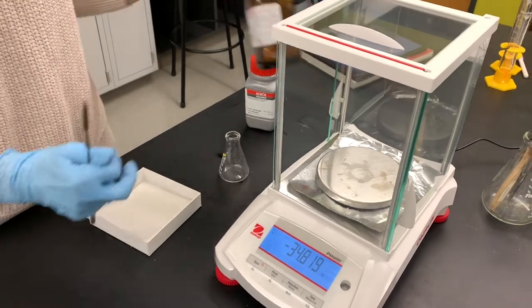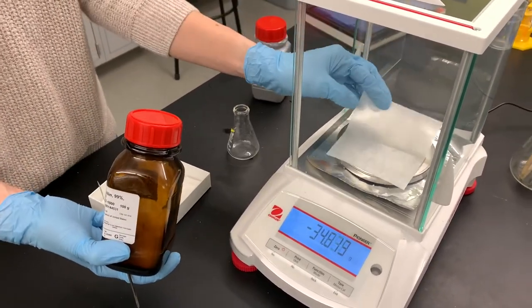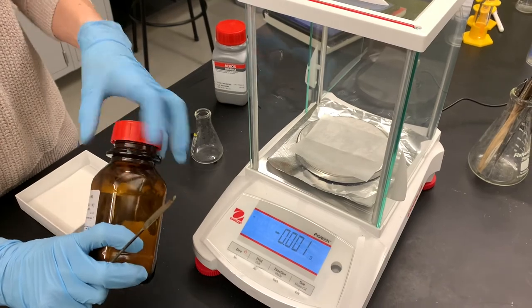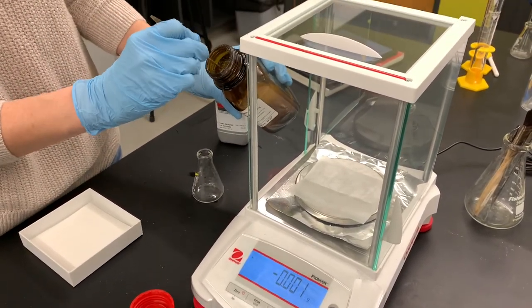Okay, so for this one, we're going to be starting with vanillin, about 1.5 grams. Vanillin is the extract of vanilla. So this smells good. It's just maybe too much of a smell.